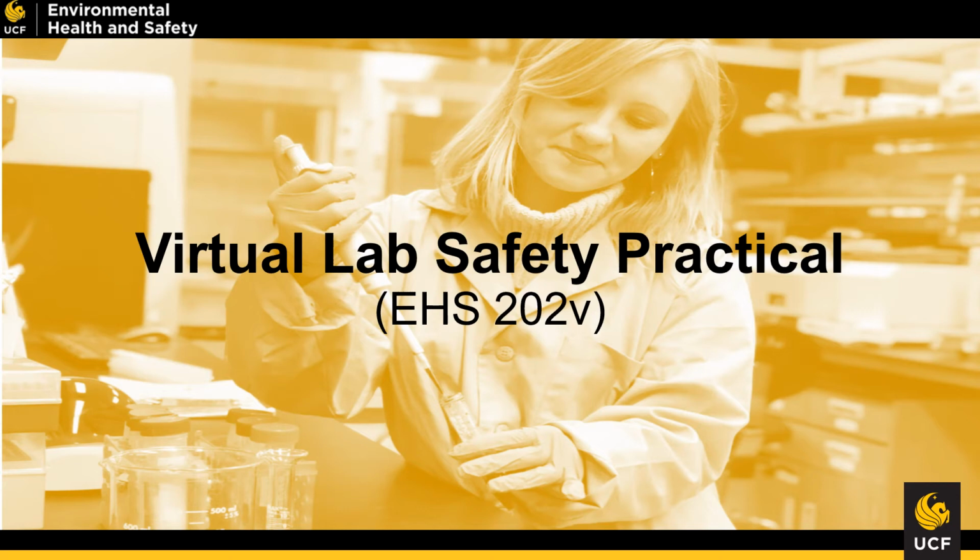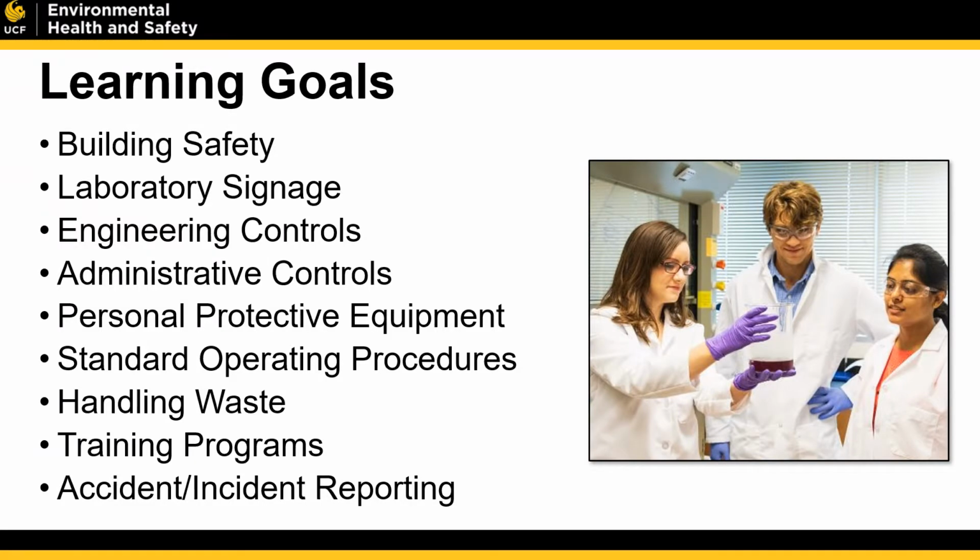Welcome to your online laboratory safety practicum. This laboratory safety practicum will replace the standard in person laboratory safety practicum. In today's online practical, we'll be going over some of the key essential features of laboratory safety.